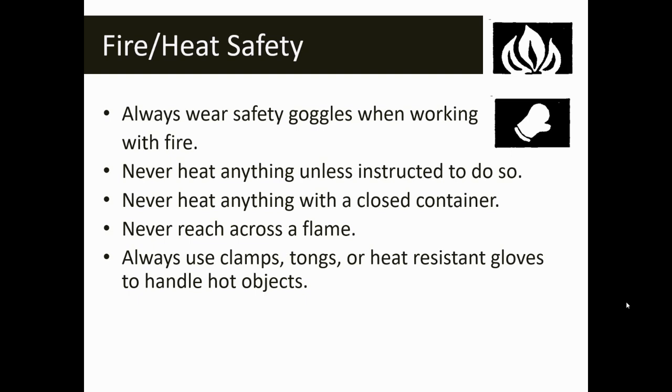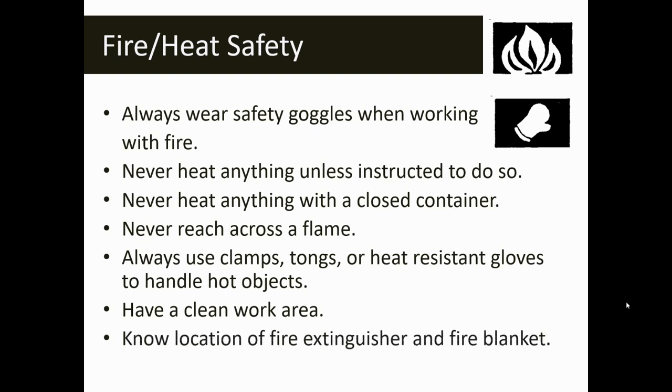If you have to handle hot objects or move them, make sure that you use something that protects your hands — clamps, tongs, or heat-resistant gloves. It's a good practice to always have a clean work area anytime you're in the lab, but definitely when working with heat or fire. You're also going to need to know the location of your fire extinguisher and fire blanket — your classroom teacher will show you how to properly use those and where they're located.